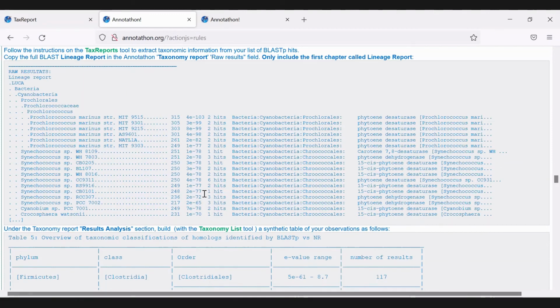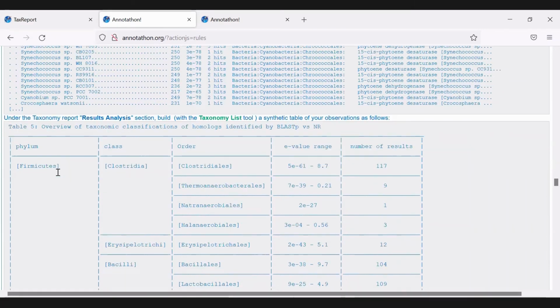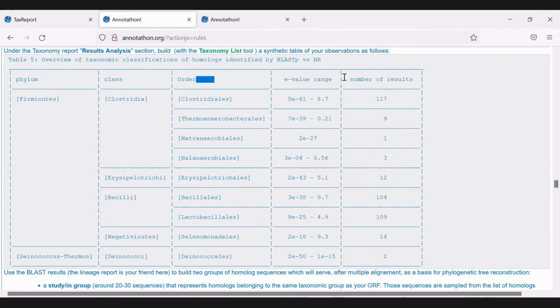Can we continue? So when you are finished, we have to create the table file, where you have the different taxonomic classifications. You will start with the phylum, class, order, and what else do you have after the order? Class here. Family, and then the next one.